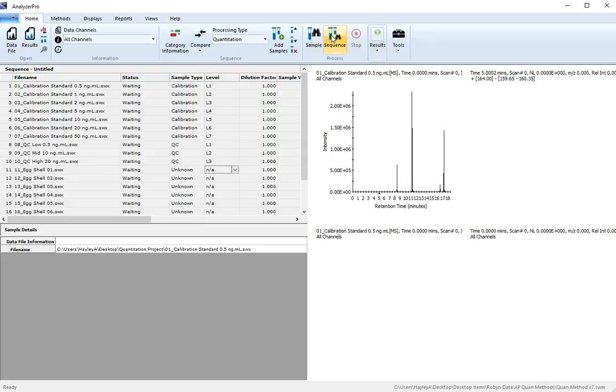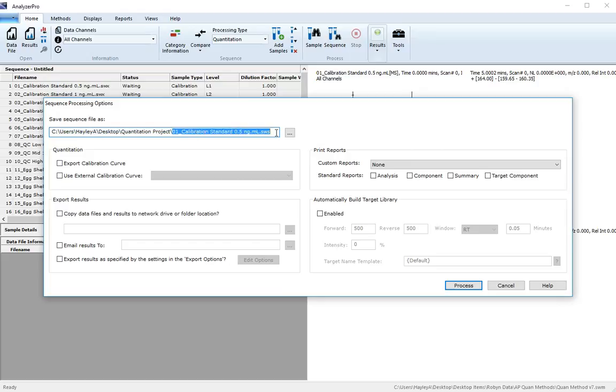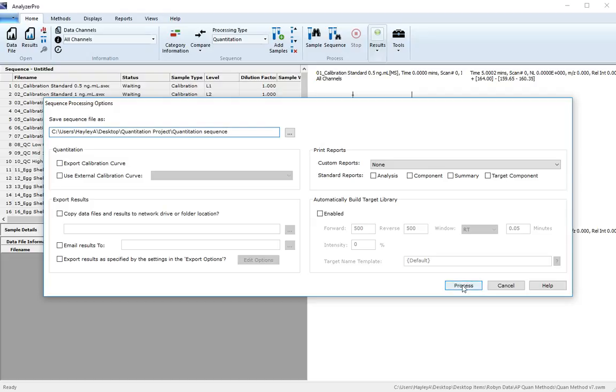We can now process our sequence. Give your sequence an appropriate name and make sure it's being saved in an appropriate location. Now click Process.